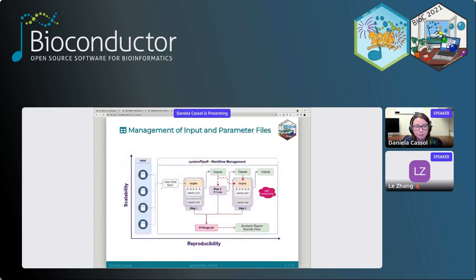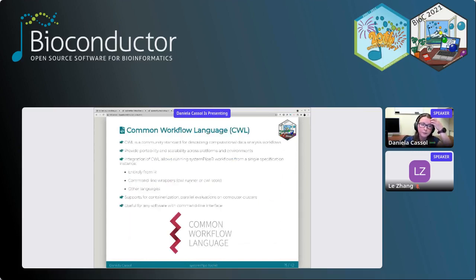As I mentioned earlier, the downstream input and output are controlled internally by the workflow instance. So here in this example, in step number 1, we created some outputs, and those can be used in the next steps, establishing the connection between steps and not requiring any additional external input for this.